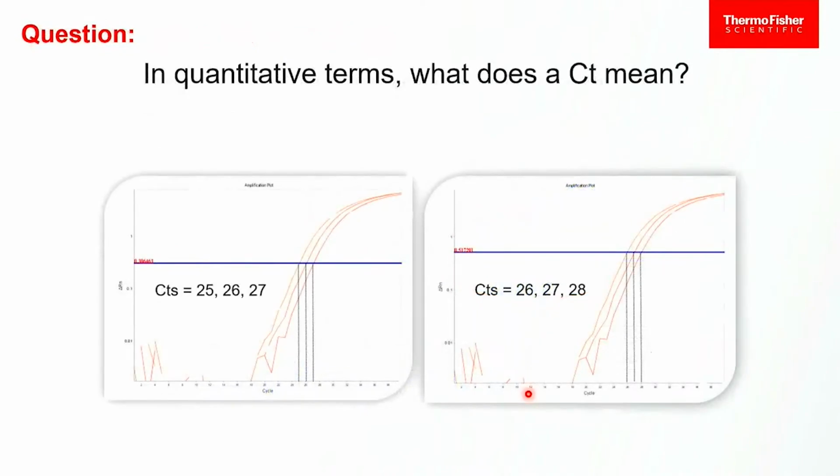What does the CT actually mean? The term definition is the cycle at threshold. Where does it cross that point? Sometimes you'll see a term called CQ. It is cycle for quantitation. The way we're talking about it today, they're the same thing, so mentally, you can kind of swap them out.